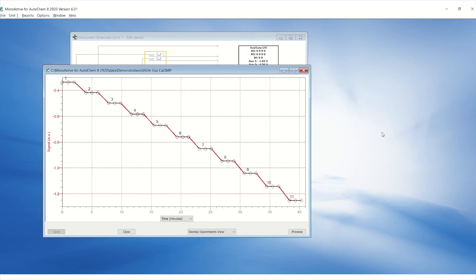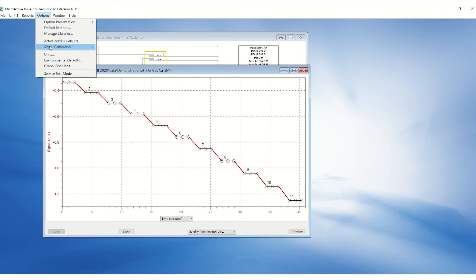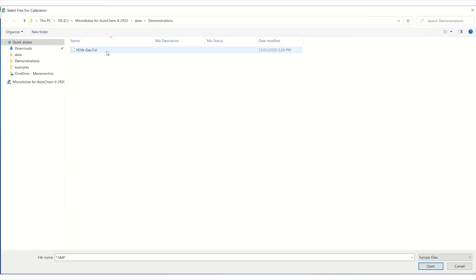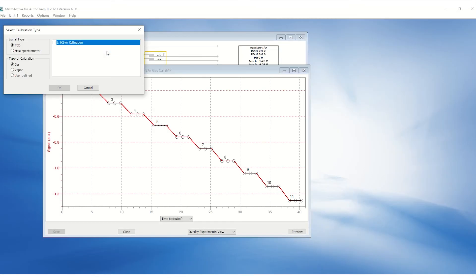To create a calibration curve from this SMP file, select Options, Signal Calibration, New. Then select the gas calibration SMP file. Select TCD for signal type. Then select Gas for type of calibration.